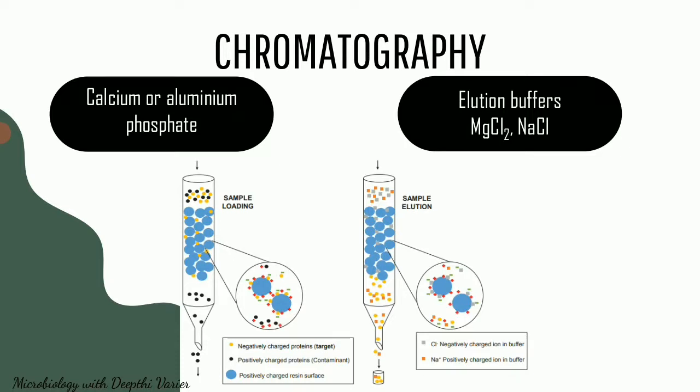So ion exchange is one of the commonly used chromatographic techniques. You can go for adsorption, we can go for affinity chromatography, size exclusion chromatography. There are different types. But ion exchange chromatography is one of the widely used mechanisms for even the separation of viral particles and many other biomolecules. What this is based on is the charge. All the charge based virus interactions are dependent on the difference between the isoelectric point of the virus and the charge on the surface matrix.